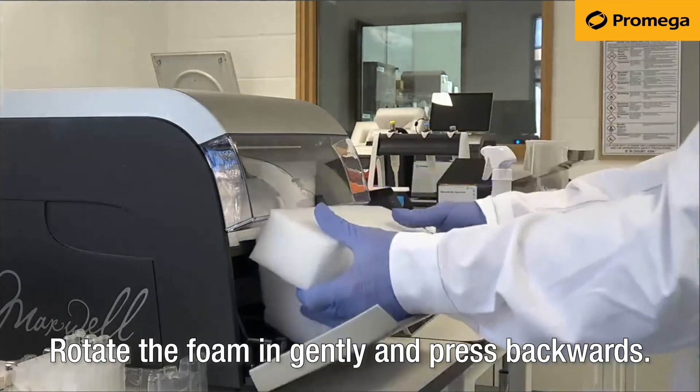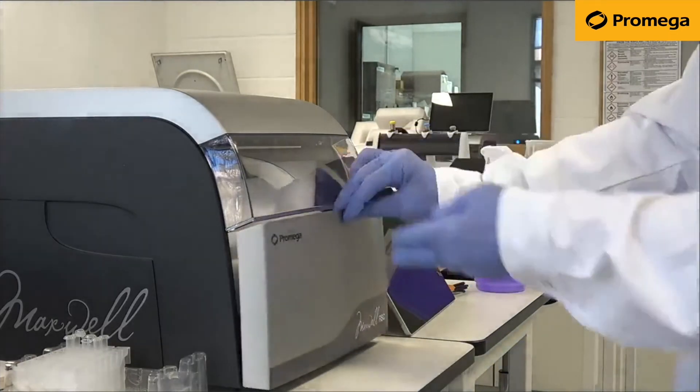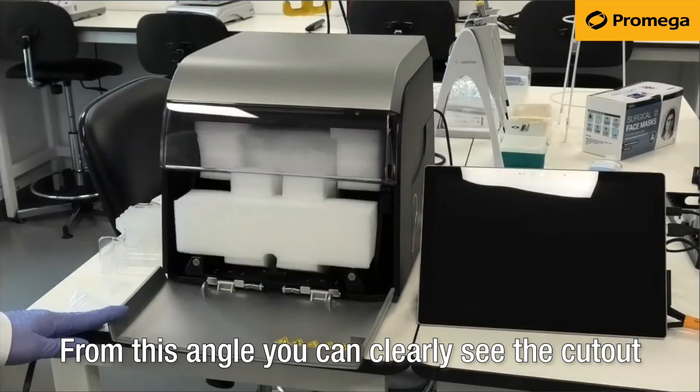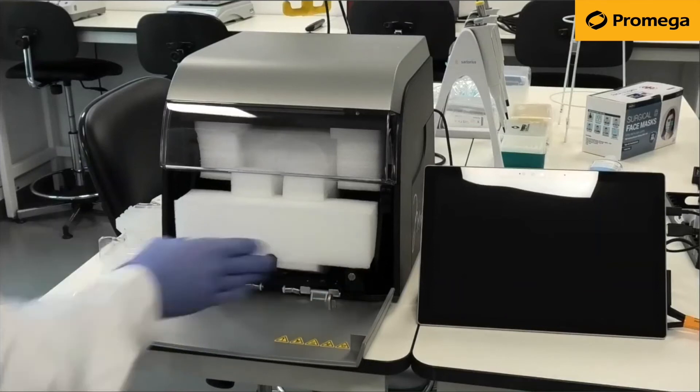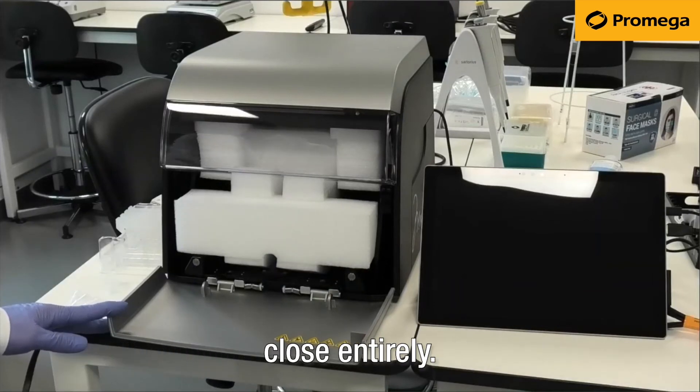Rotate the foam in gently and press backwards. From this angle you can clearly see the cutout on the bottom. When the foams are inserted, the door will not close entirely.